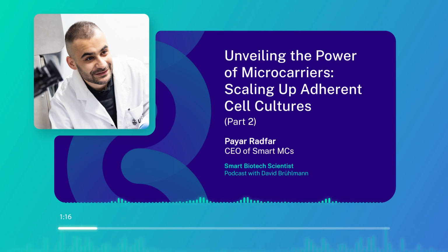Let's smarten up biotech. And we now make it very practical, Payar, and break it down in a few simple steps. So for someone who wants to develop an adherent cell culture, how should they start and what should they do to succeed? By adherent cell culture, I'm talking about microcarriers, particularly when you have a vision of scaling up. Let's put it that way.